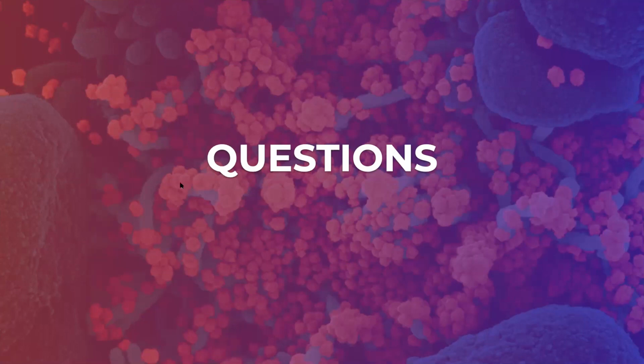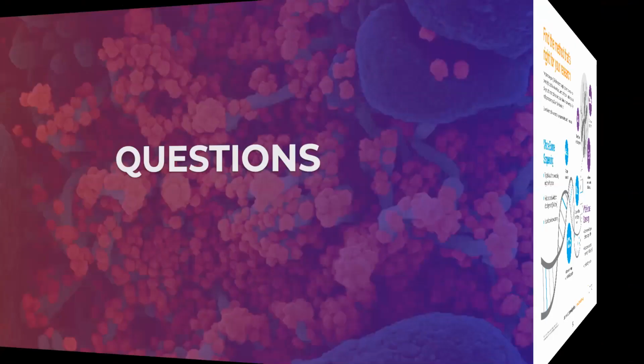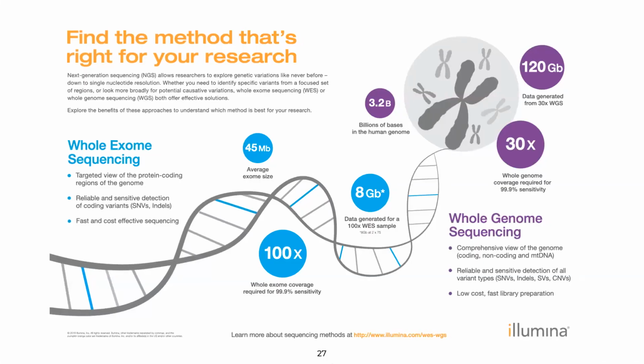Okay, so let's talk about the process of sequencing a little bit. When we look at sequencing and we speak about generating digital data from this genetic material that we've collected, how can we inspect different types of information from the sequencing data? So when we talk about Illumina sequencing, which is the predominant, most popular way of sequencing today, we're talking about sequencing of short reads.